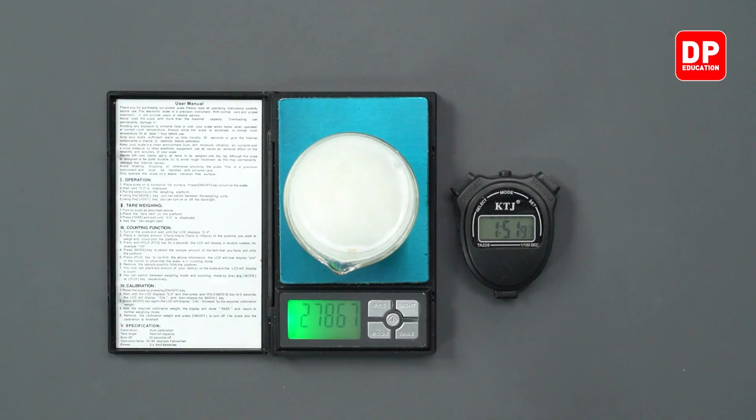We are moving on to the sixth reading. Sixth reading is 278.60. That is the sixth reading. We will take 10 readings for this one as well. When it comes to the seventh reading, it is 278.44.